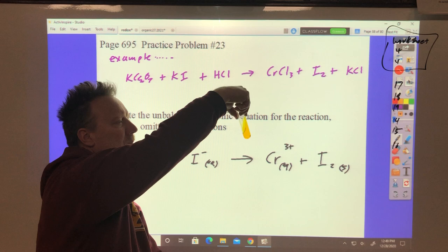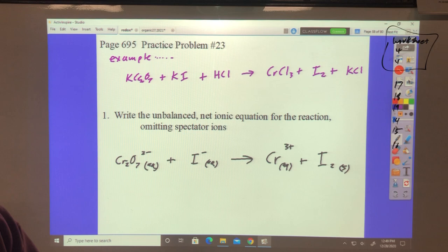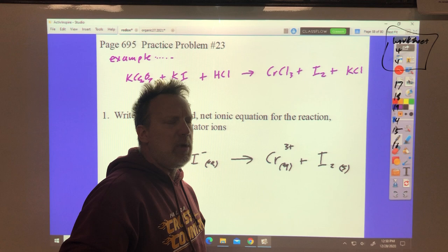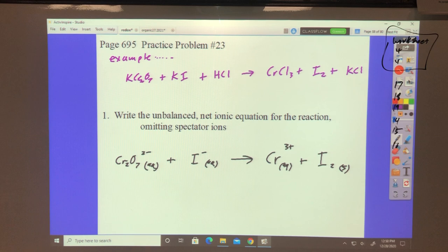Okay. So I'm going to put some of this in there. The dichromate ion is a very orange ion. Iodide ion is clear. We see that over here, it was a clear solution. The chromium 3 plus ion is a pretty green color. And then we produce iodine, which is kind of that purply color.